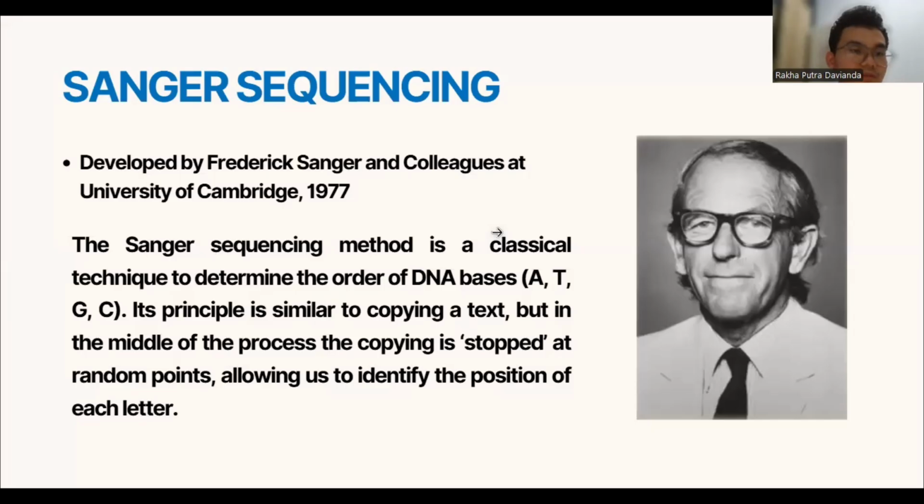Alright, I'm Raka Putra Davianda. I would like to continue with the Sanger sequencing method. The Sanger sequencing method is a classical technique to determine the order of DNA bases, A, T, G, C.